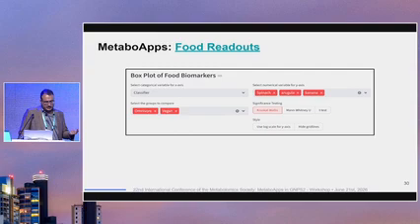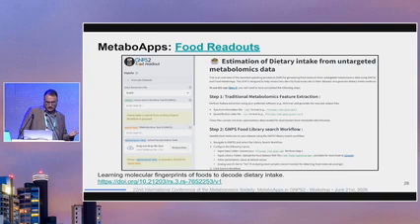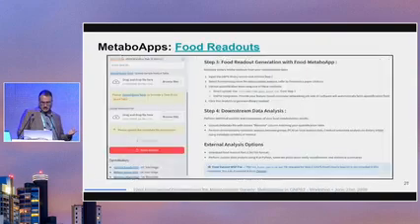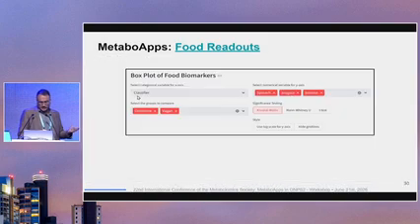And the classifier for this case, as I showed before, is the example based on the NIST vegan omnivore data set. Basically, the diet information we have for this one is omnivore and vegan, of course.